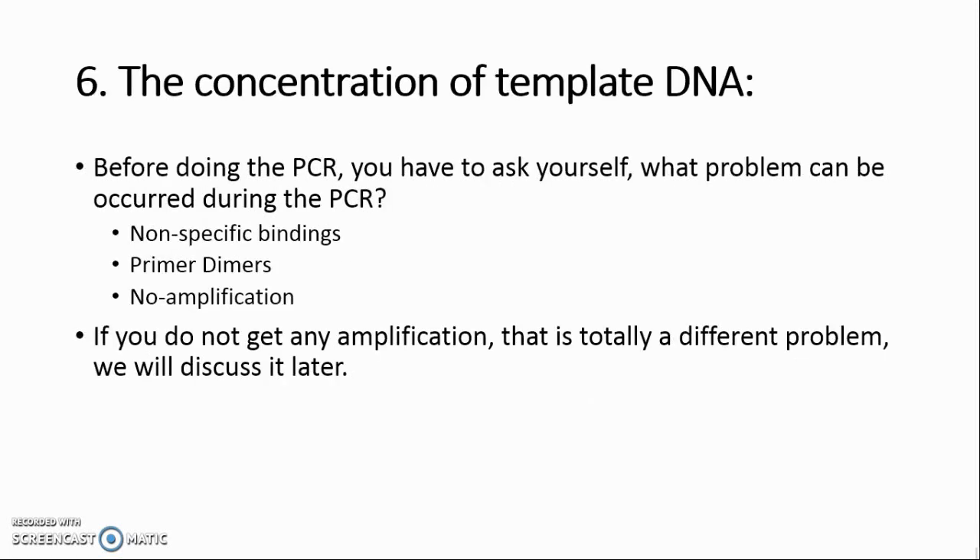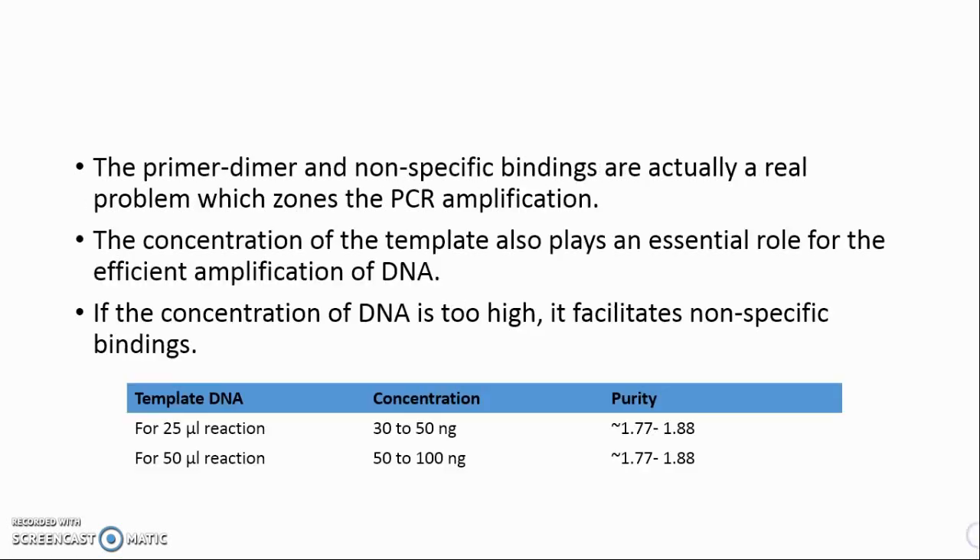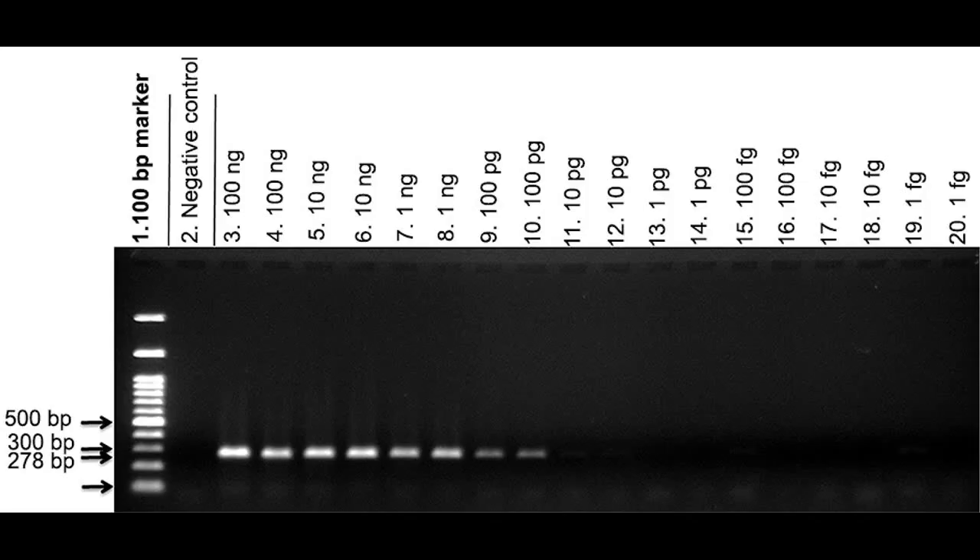Tip 3: The concentration of template DNA. Before doing the PCR, ask yourself what problems can occur: nonspecific bindings, primer dimers, or no amplification. The concentration of the template plays an essential role in efficient amplification. If the concentration of DNA is too high, it facilitates nonspecific bindings. It is always preferred to use 30 ng DNA in a 25 microliter reaction — and in fact, concentrations lower than this can still amplify DNA appropriately.